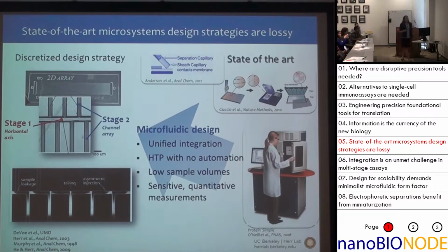So typically, people will use a microfluidic chip that looks something like this. So you're looking down on that chip right here. You can see these little white lines. Those are microchannels. How many of you have used microfluidic chips or touched them? Even in the last day, it still counts. Could you raise your hand pretty high so I can just see who isn't? Raise their hand. OK, perfect.